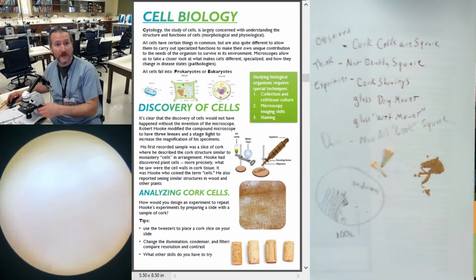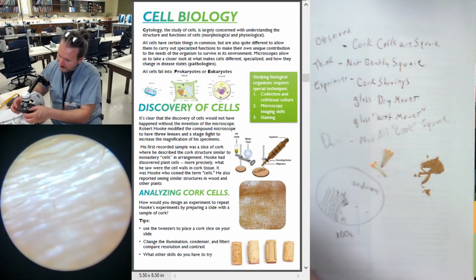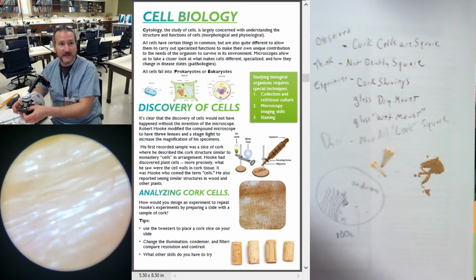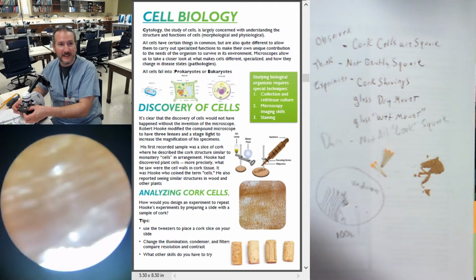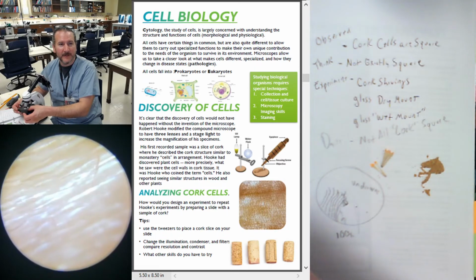I know I'm already looking at pencil. That's kind of cool. It's a bit different than cork. This almost looks fibery, like stringy fibery. Ooh, there's a splinter waiting to happen right there. You see it?